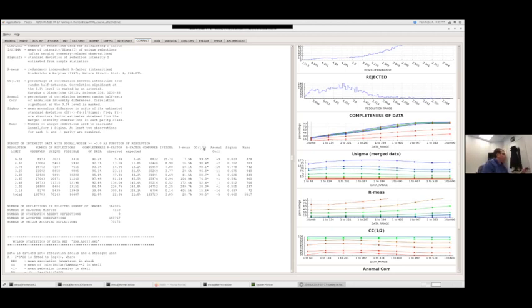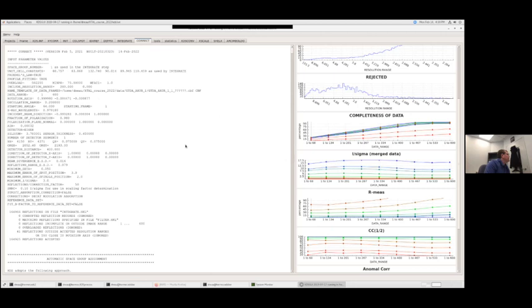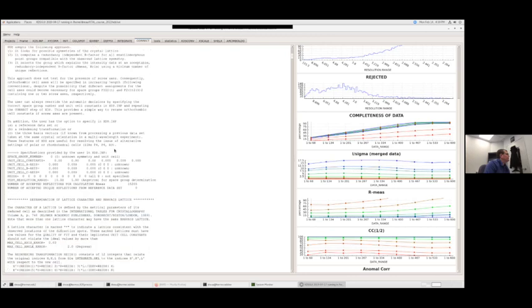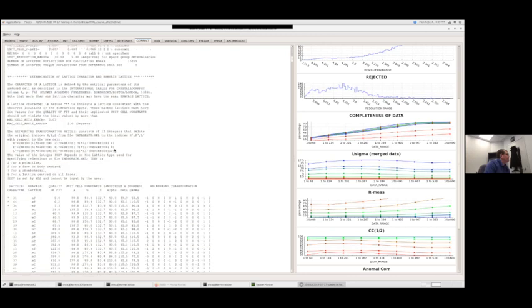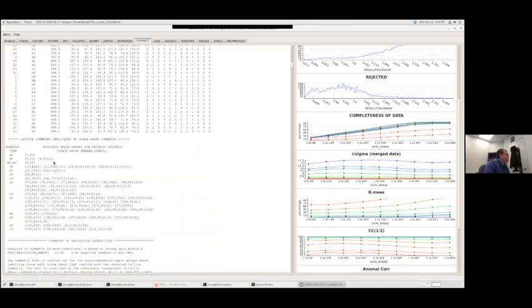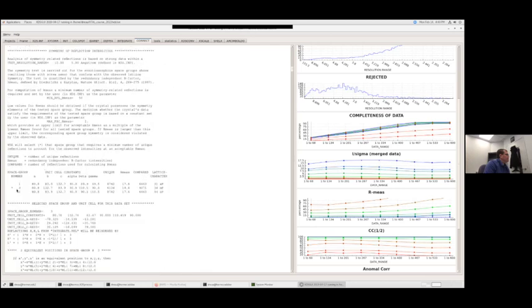Oh, before I go on, the other things you can check in the correct log file are the automatic space group assignment. That's up near the top. And again, you have this table of Bravais lattices and what fits best. It's saying anything with a star is a possibility. And then it actually checks different space groups, and then it decides to pick something.